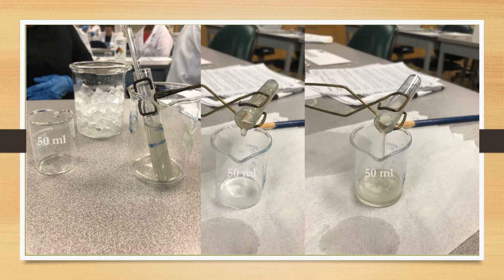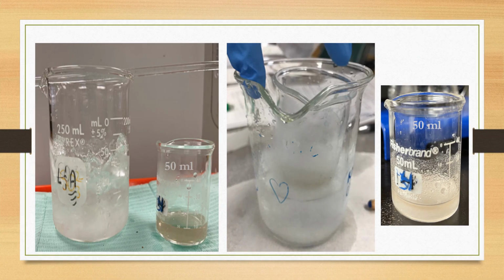Cool the reaction mixture by returning the test tube to an empty 150 ml beaker on the benchtop. While the reaction is cooling, prepare a 250 ml beaker of ice bath. Carefully pour the contents of the test tube into a clean and dry 50 ml beaker. Place the beaker into the ice water bath for about 10 to 15 minutes to allow the alum to crystallize.